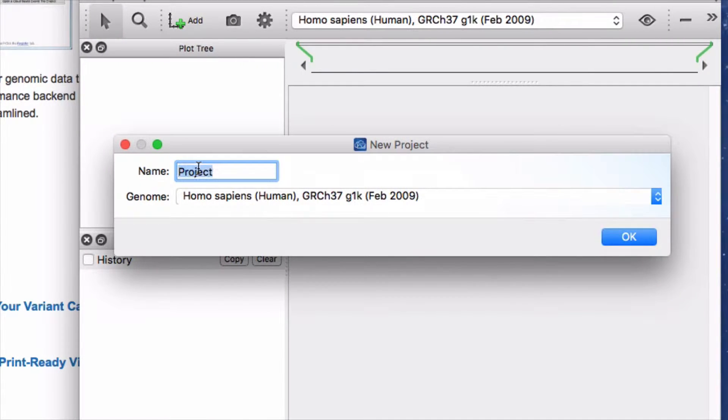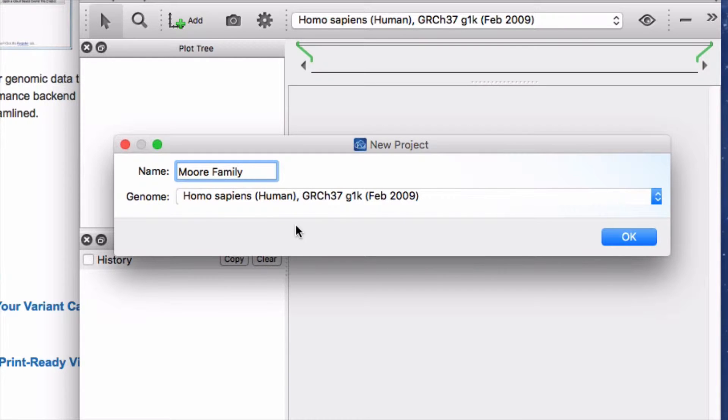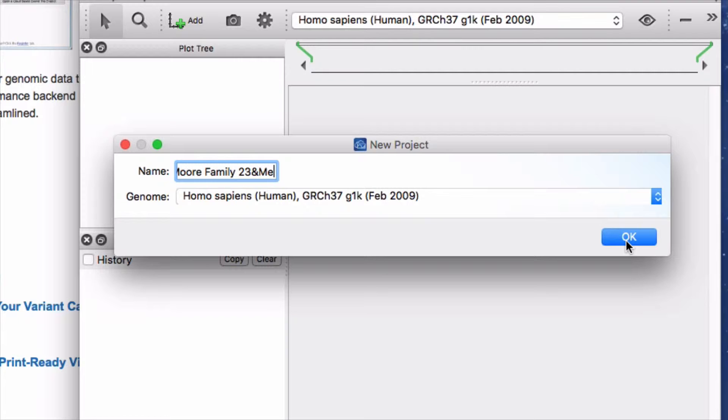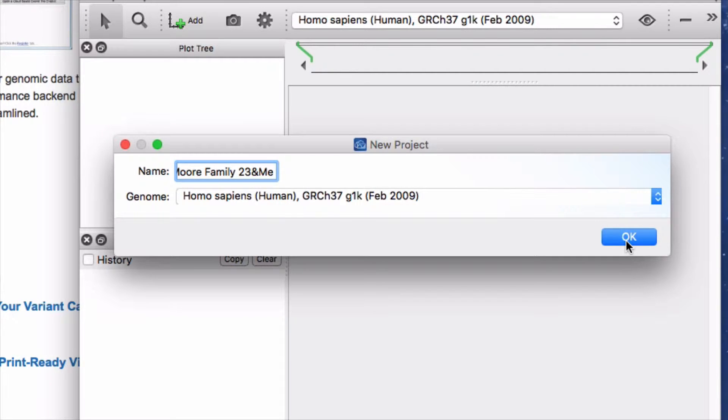Let's call the new project More Family 23andMe. GRCH 37 is the Genome Reference Consortium's Human Genome Build 37. GRCH 37 is not from one individual's genome sequence, but is built from reference sequences of different individuals. Although Build 38 is the current standard reference assembly sequence, Build 37 is still used by many testing services and researchers.